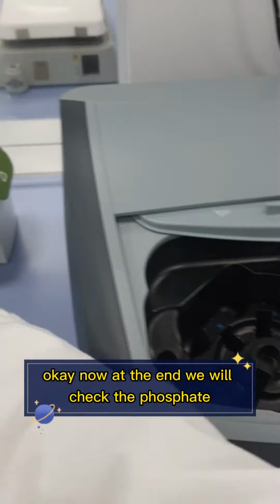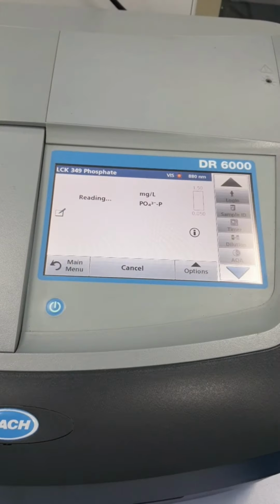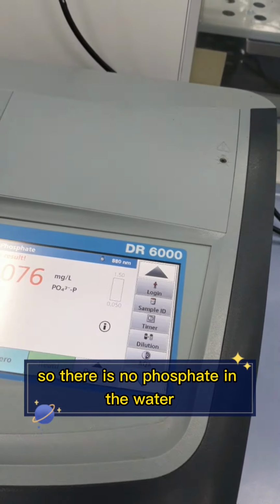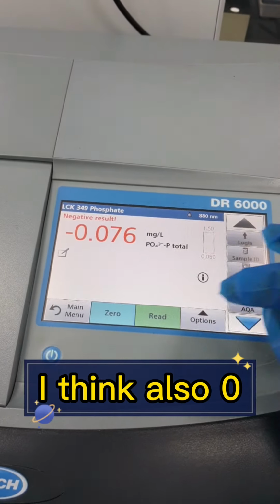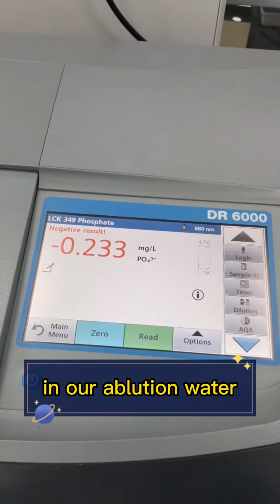Now at the end we will check the phosphate. So there is no phosphate in the water. We can check the other forms. Okay, the total is also, I think, 0. So this means there is no phosphate in our ablution water.